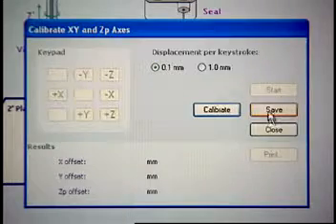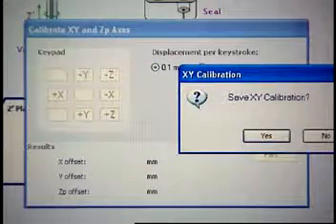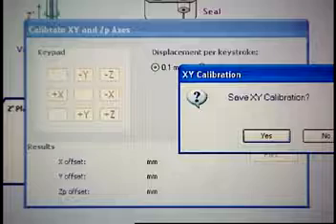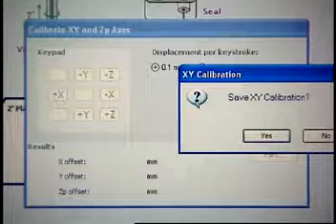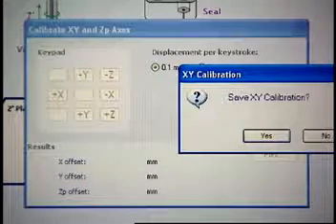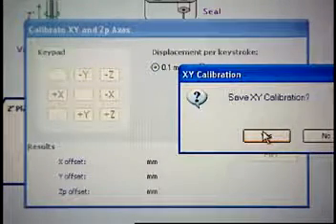Click Save. This action stores the XY and ZP values to memory. When the confirmation window appears, click Yes.